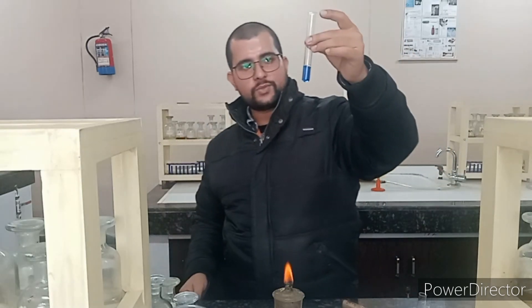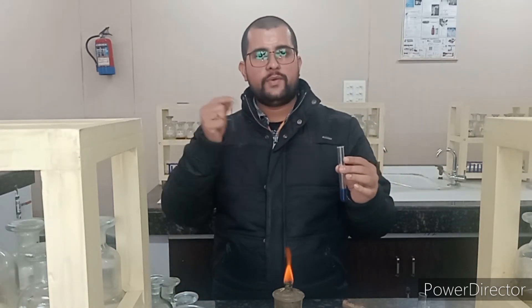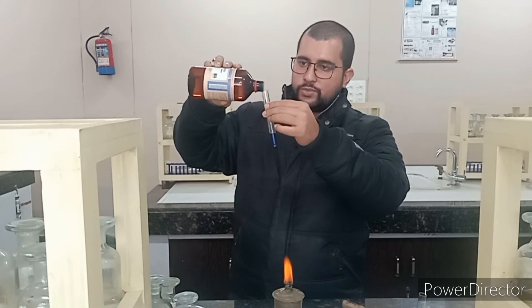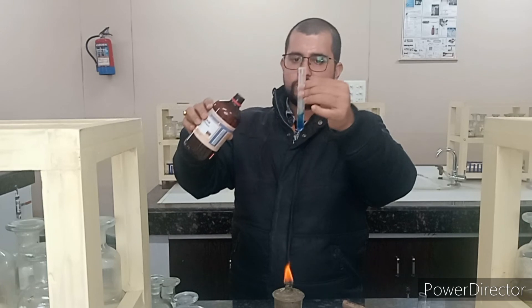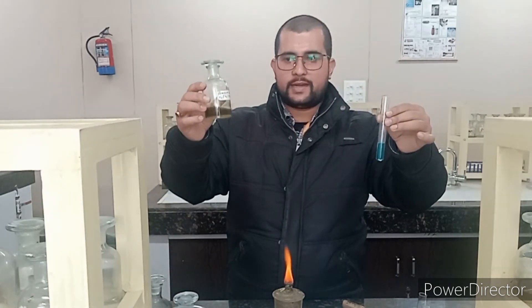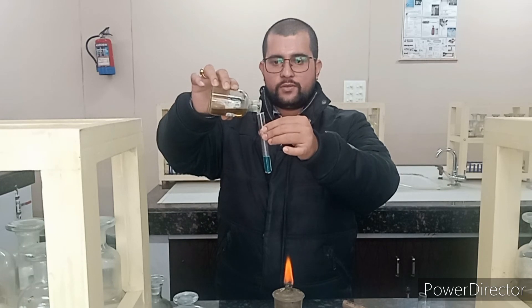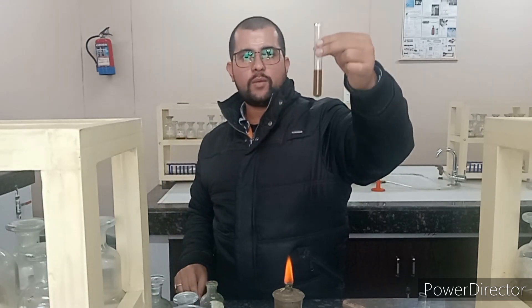Now we have to confirm that copper is present in the sample. For confirmation, we will add a few drops of acetic acid and then potassium ferrocyanide — it will give a chocolate brown precipitate confirming copper's presence. I am adding acetic acid — just one to two drops — and the color will change from deep blue to sky blue, its original color. Now I am adding potassium ferrocyanide slowly. You can observe which color appears — a dark chocolate brown color is appearing. It means that in the given sample, copper is present.